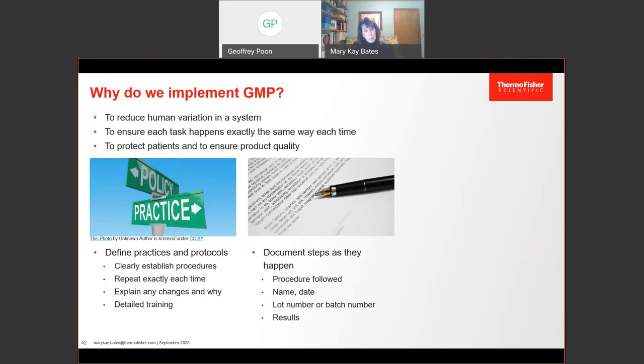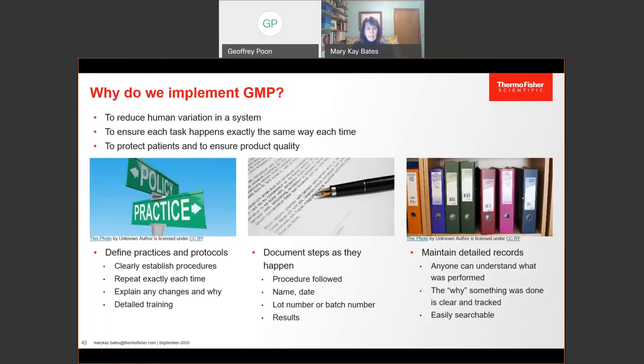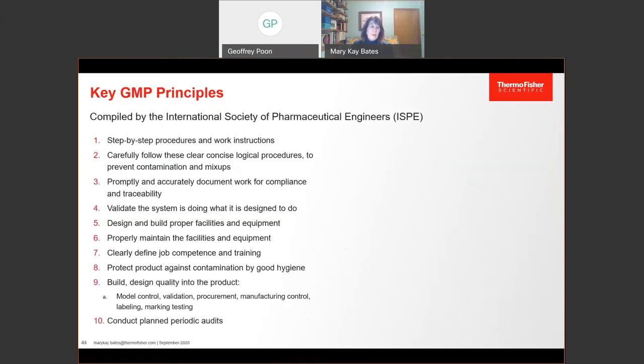Another part of GMP is to document all the steps as they happen. This is a very important part of GMP. It's not like in an academic lab where you can make a note on a paper towel and transfer that to your laboratory notebook later. In GMP, the exact procedure must be followed and noted, including the name of the person performing the task, the date, the lot number, and the results. These are simply minimum requirements. Finally, GMP is about maintaining details. The goal is that anyone can look at these records and understand easily exactly what happened and how. But it's also about why something was done. Everything has a reason and such reasons must be reported.